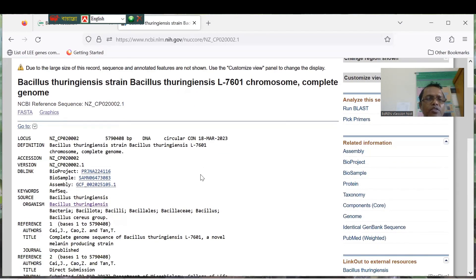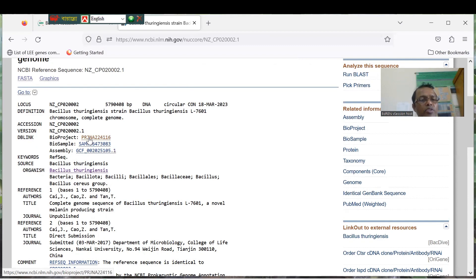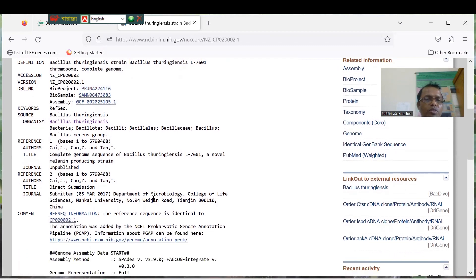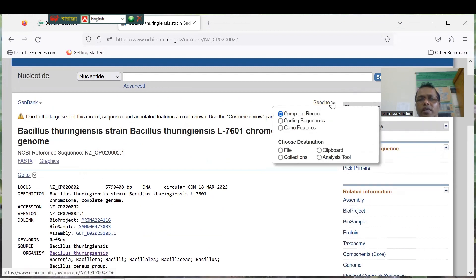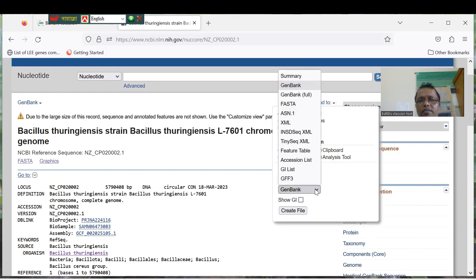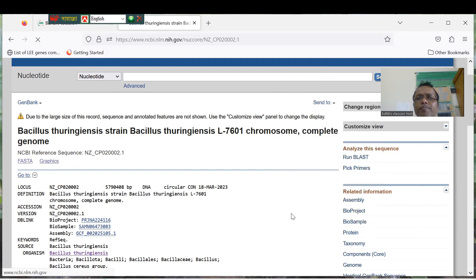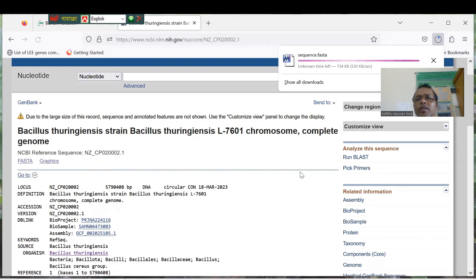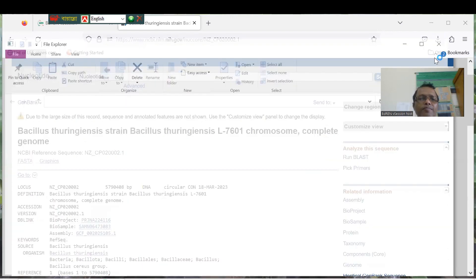You can see this is the Bacillus thuringiensis strain with its BioProject number. From the BioProject you can get the whole genome sequence, and the complete genome sequence is available here. Click Send To, then click File, and select GenBank as the format — or say FASTA format. Then click Download. The download is complete.